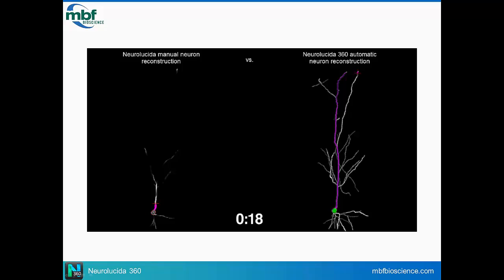Haley asks, what's the advantage of using Neurolucida over ImageJ or Neuron Studio other than convenience and ease of use? I have a vested interest in this because, of course, I care greatly about Neurolucida. I also care greatly about convenience and ease of use, so I think those things are extraordinarily important. And I'll let Dara provide her feedback too, because she's spent many years using Neuron Studio, and you were very important in the implementation of it.